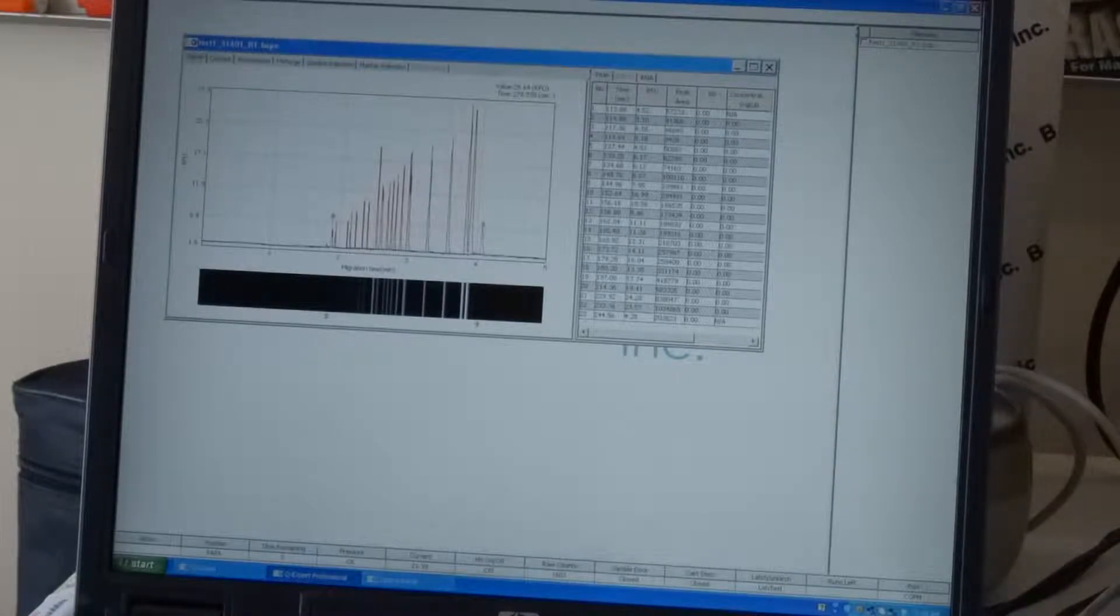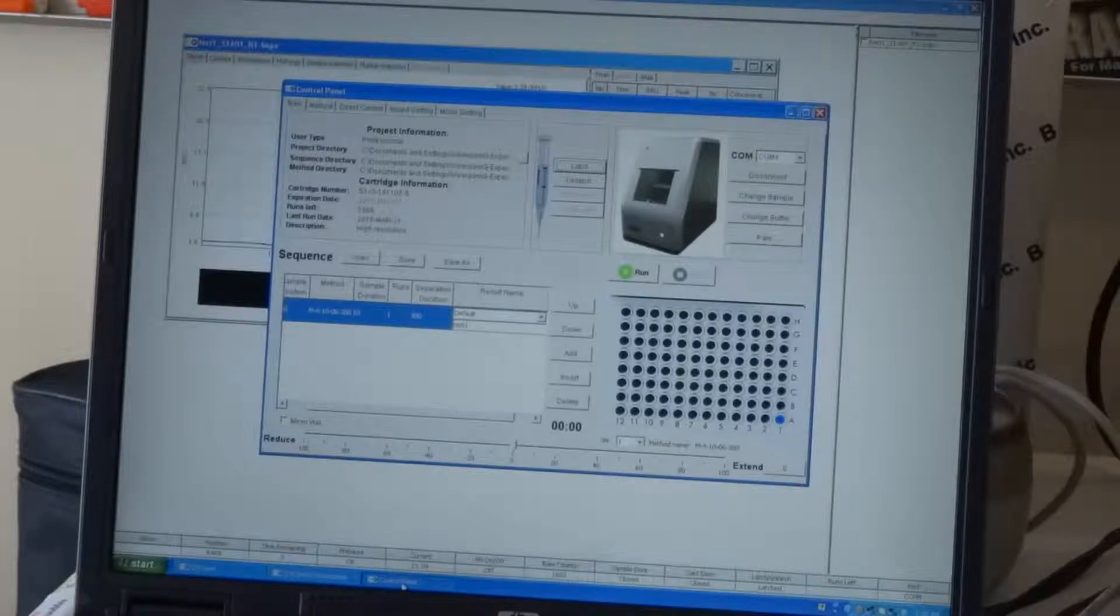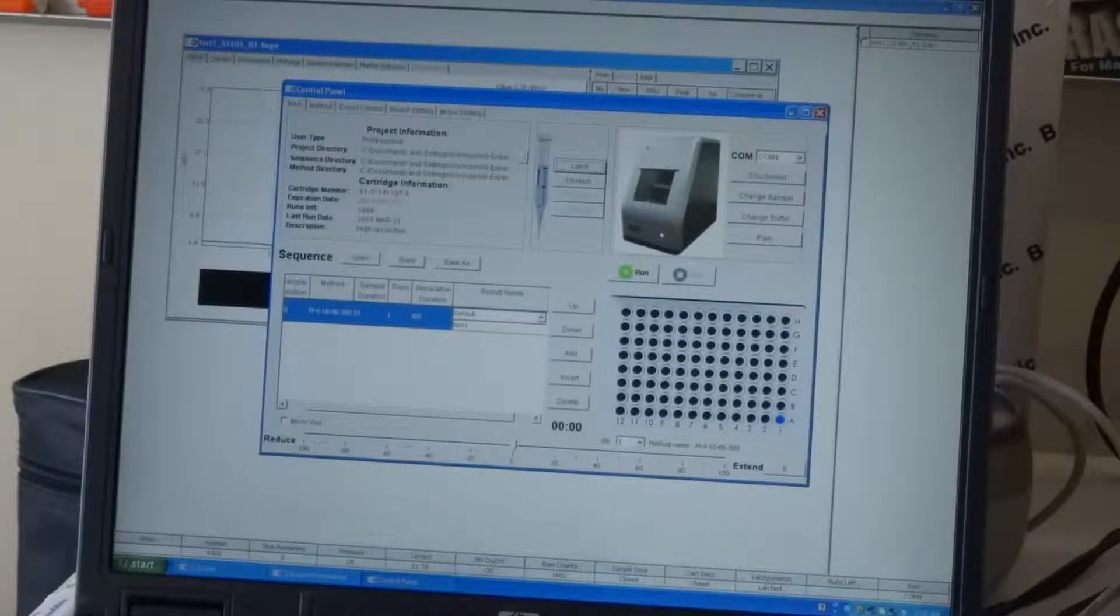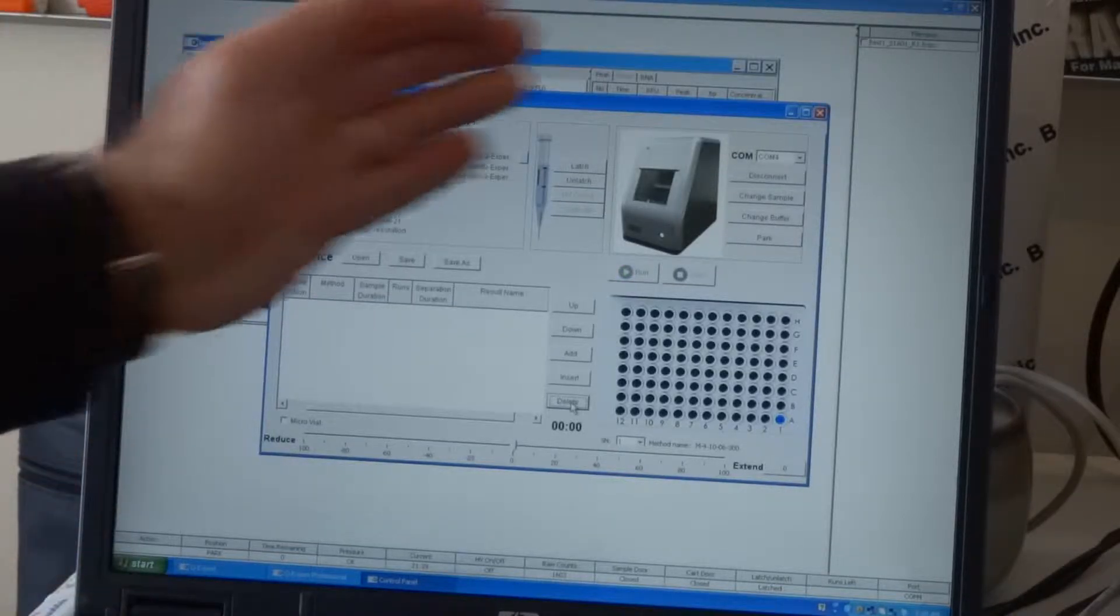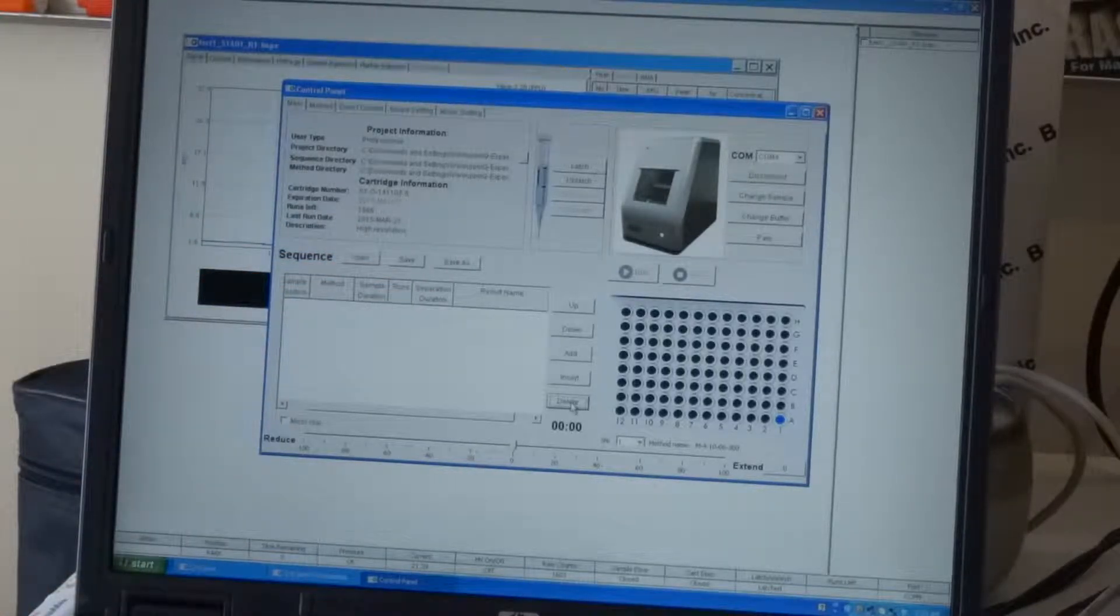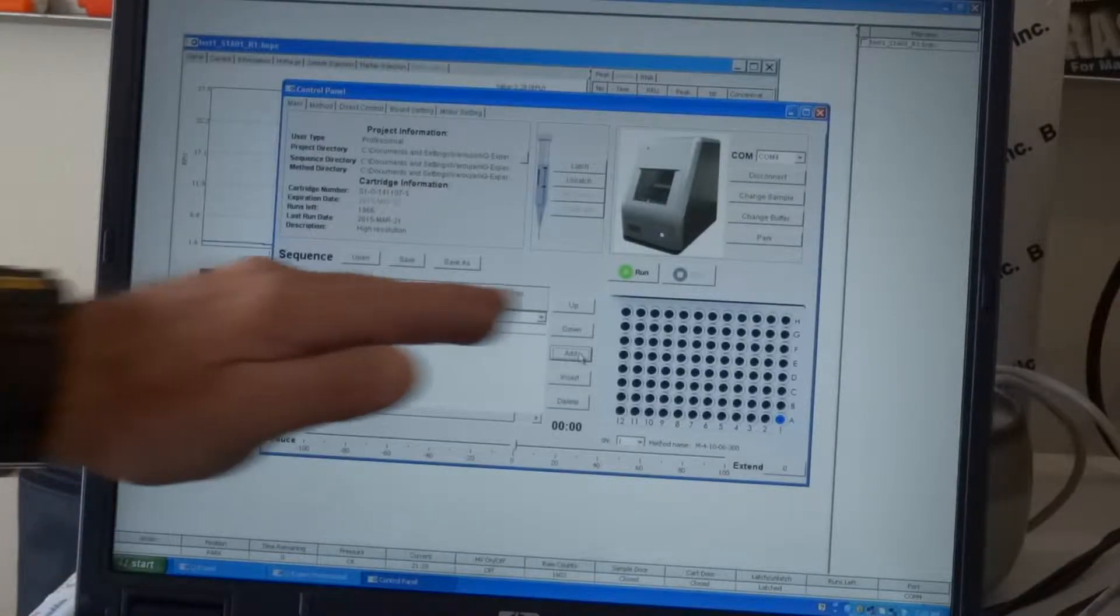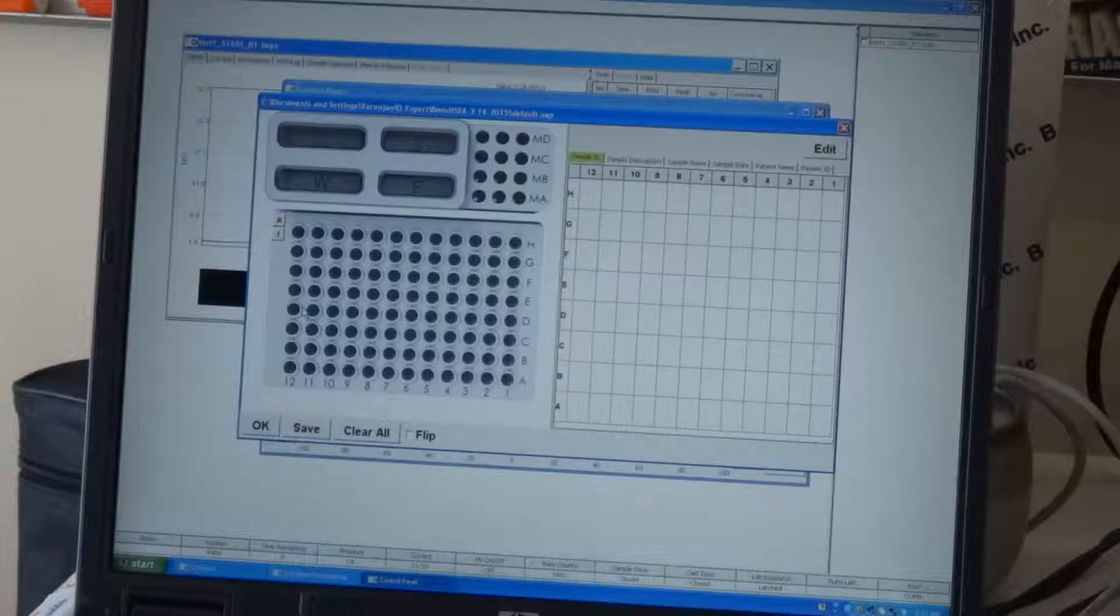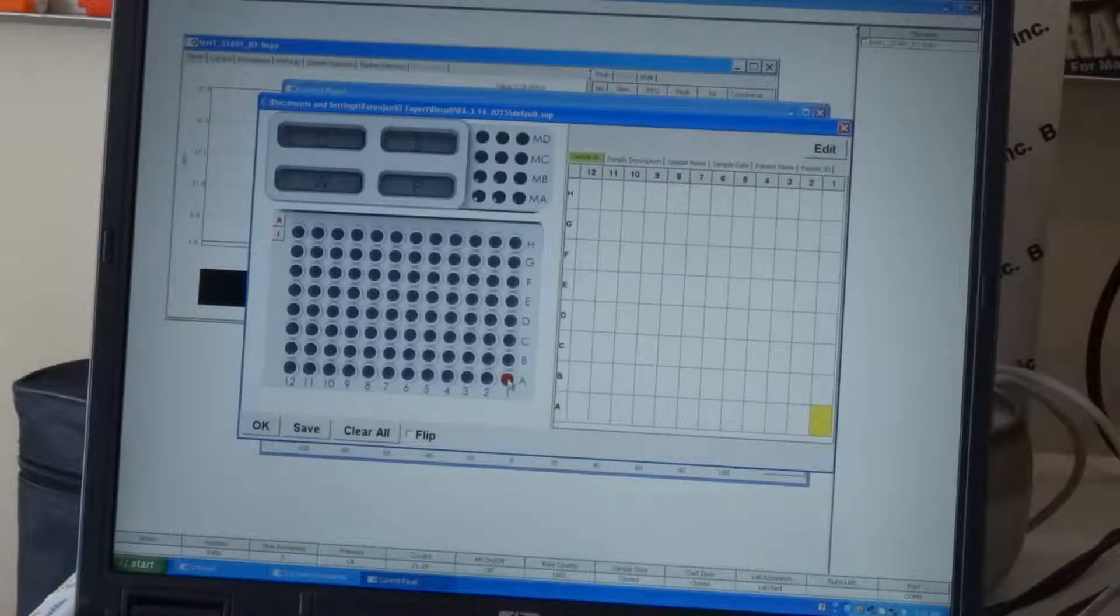After that, we proceed to the run of the DNA ladder. To run the DNA ladder, as we have loaded the samples in the positions, in this case, as you can see on the user interface, the sequence basically is to generate number of methods to run your samples. It's very simple. You click the button Add and it will add a line in the sequence table. The first thing you will do is basically designate the sample. Of course, in our case, it's position A1.